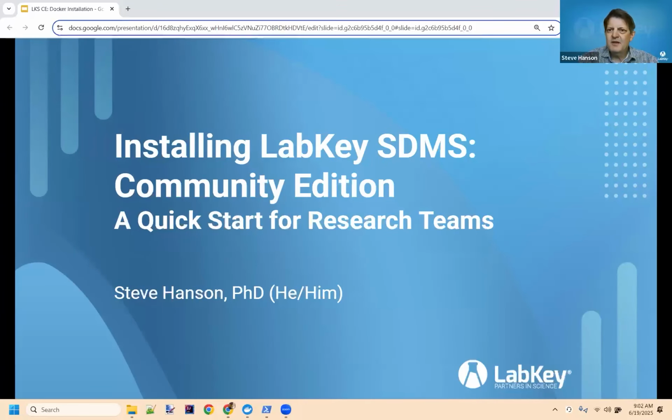Welcome again to everybody. I'm Steve Hanson. I'm an account manager here at LabKey and the director of user education. And today we're going to discuss really a new way we've developed to install the LabKey Server Community Edition, the SDMS, the Scientific Data Management System.